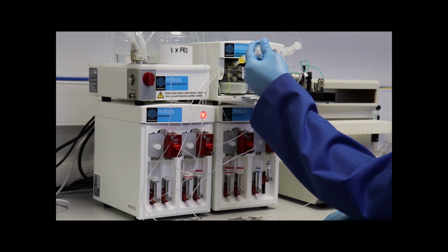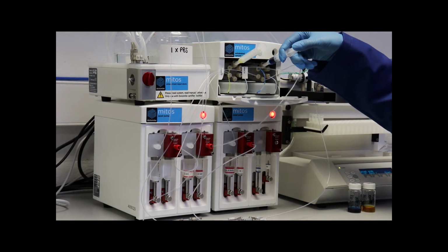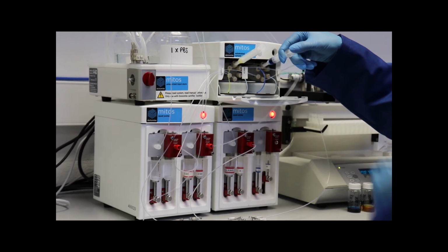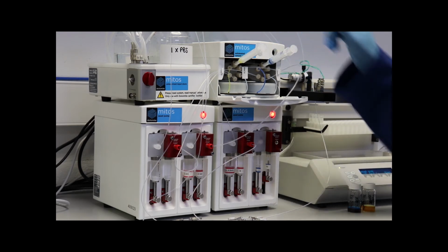I pre-filled these syringes. Now the first one is done, and it's gone into these sample loops. And hopefully you can see the blue one is filling the second sample loop. Okay.